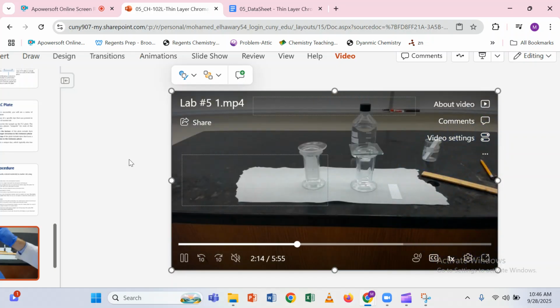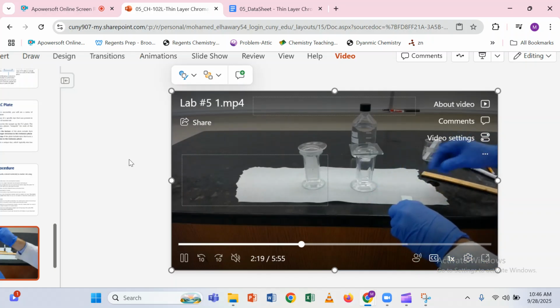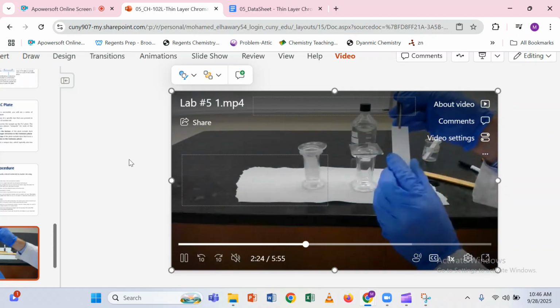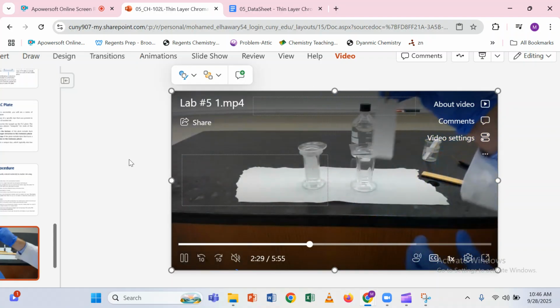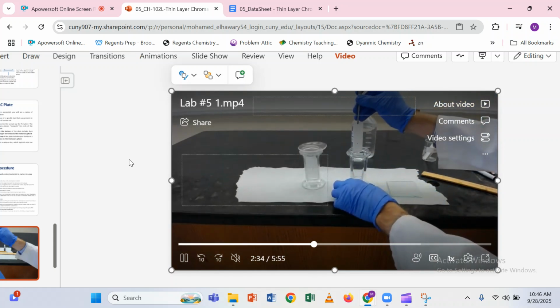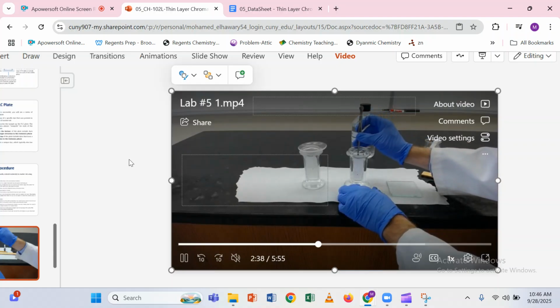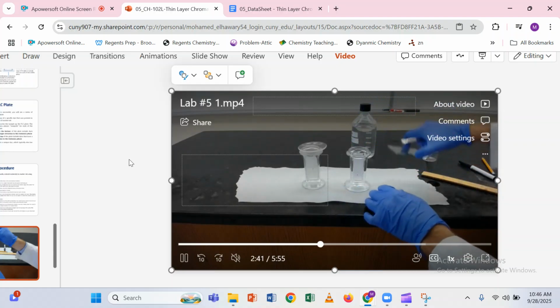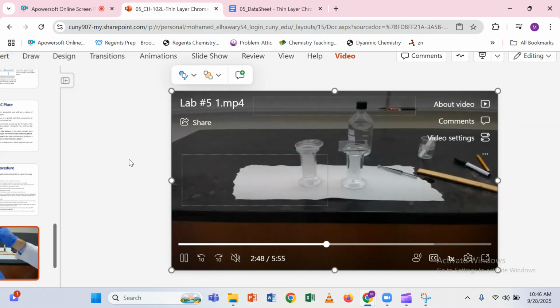All right, we're going to do another experiment quickly, but this time, instead of a very small dot, it's going to be a bigger dot, and we'll see what the difference is. As you can see, it's not a small dot; it's a considerable amount of dye, and we're going to lower it into a second developing chamber. We have to lower it using forceps very slowly, and then we are going to cover it up. All right, perfect. And then we're going to wait a little bit and see the results of each.